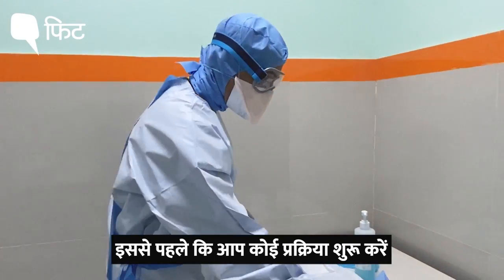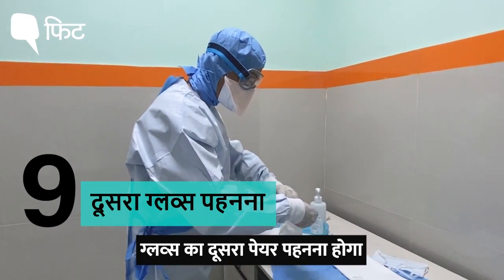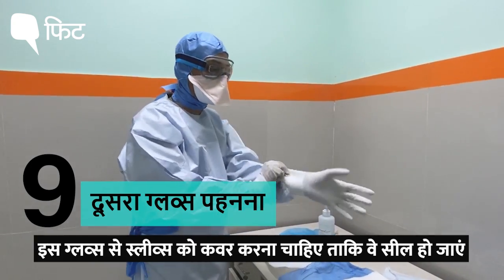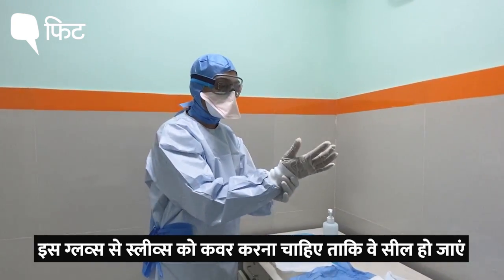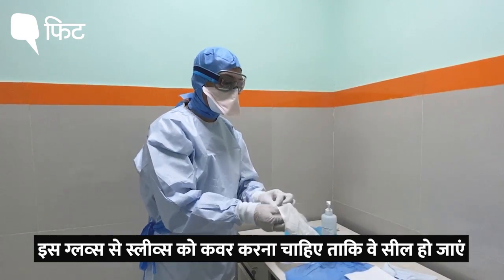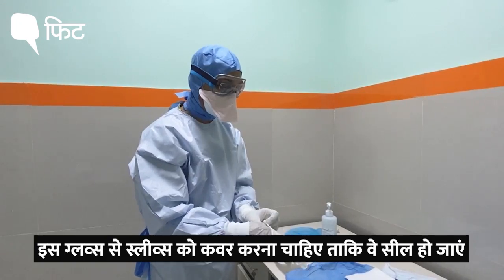Before you do any procedure, you are going to wear the second pair of gloves — over and above the first gloves you are already wearing — and this outer glove should also cover the gown so that the gown gets sealed completely.